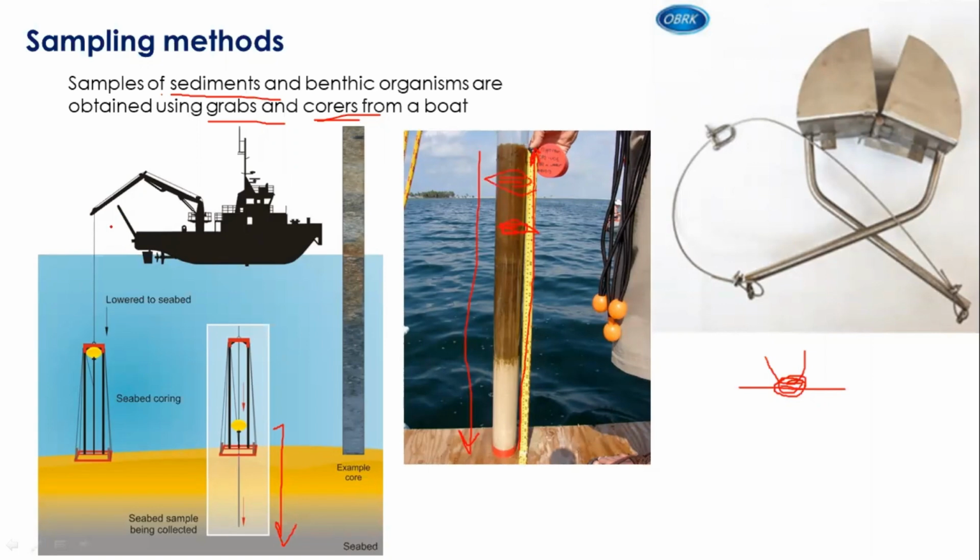But if you are going into the open sea to collect deep sea sediments, then you have to go with this kind of big tow, and once it goes to the surface, it ejects the corers, and the corer will have bacteria or microbes from the different subsurface layers of the sediments.